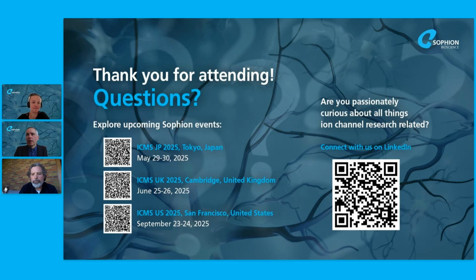And Lars asks, have you tried measuring the neurons using cesium fluoride in your intracellular solution to isolate sodium currents? Yes, we have. We actually do that as part of some of the experiments. So we use different intracellular solutions across the plates. Some of them with potassium in there, and some of them with cesium.